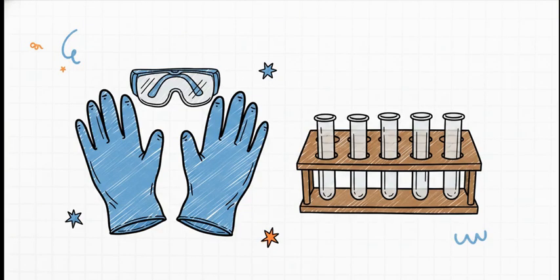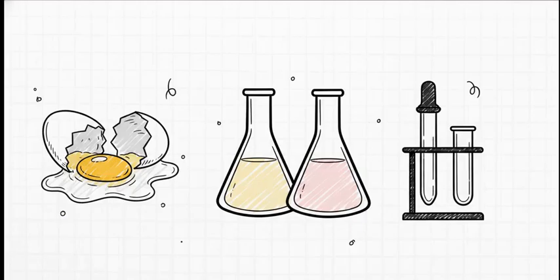All right, moving on to phase two, the lab setup. I want you to literally picture yourself at the workbench right now, gathering up all your investigative tools. Here is the exact toolkit we need for our detective work. First up, our primary piece of evidence, the protein sample. Like I mentioned, we're using egg albumin for this. Next, we need our chemical reagents. We'll need concentrated nitric acid and then a strong alkali. This can be either sodium hydroxide or ammonia. Either one works. And finally, our staging area. We need some nice clean test tubes and a pipette so we can get truly accurate liquid measurements. So our station is prepped, labeled, and ready to go.